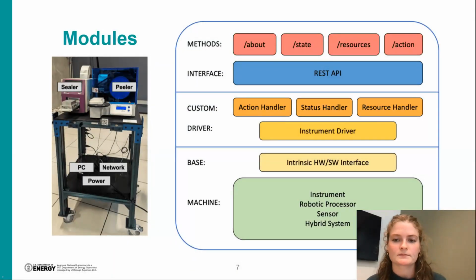Okay, so here is just a little more detail on what the software stacks look like for each instrument. The collection of the instrument and then the driver level and the client level is what we call a module. In our attempt to make this a modular system, we want the software for each instrument to be completely isolated from the other instruments so that you can add instruments to the system and take them away kind of just like Lego blocks. There's nothing connecting them together. They won't know if another one is gone and another one has been replaced.